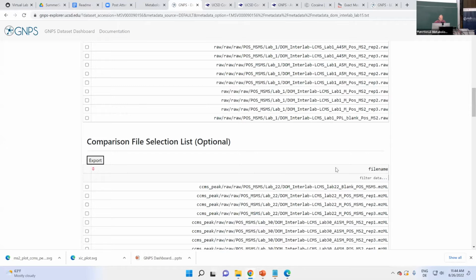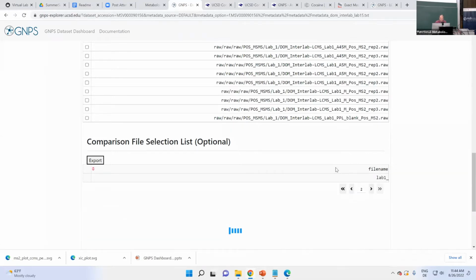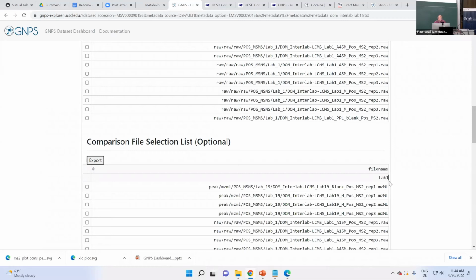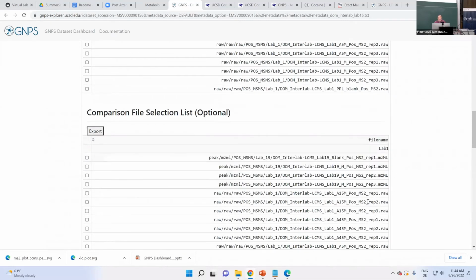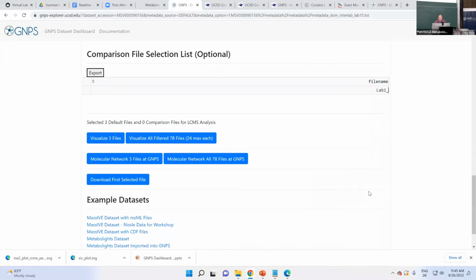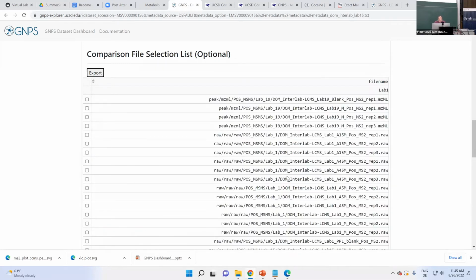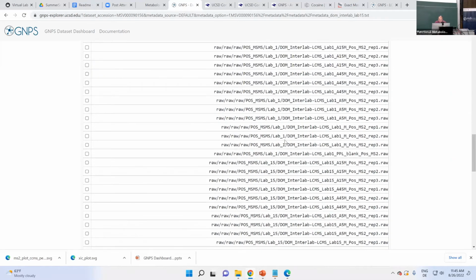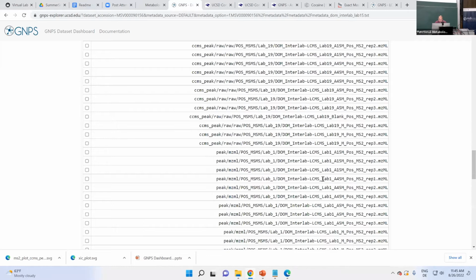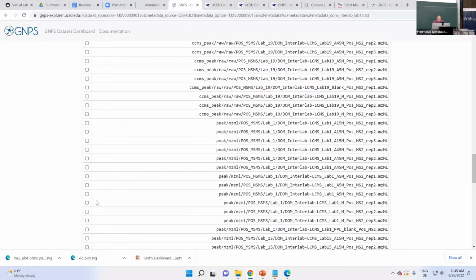And now here, when I scroll down in my comparison group, right? So here I would take the M samples.